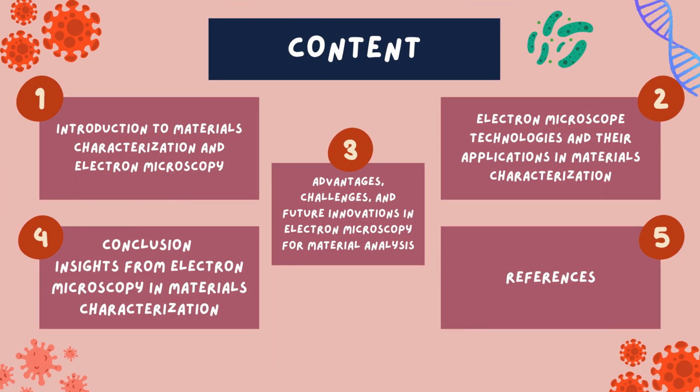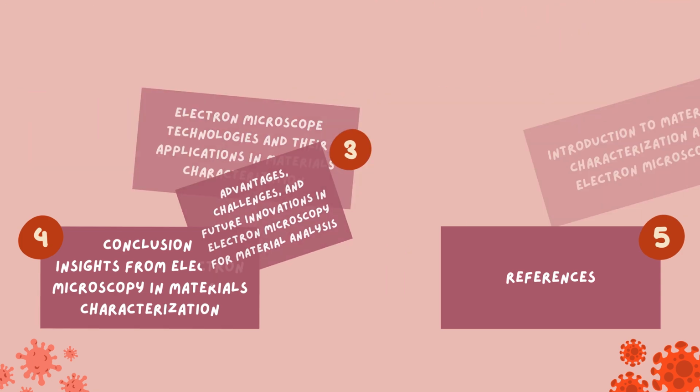So this is all the content for our presentation today. First, introduction to materials characterization and electron microscopy. Second, electron microscope technologies and their application. Then, advantages, challenges, and future innovation. And finally, conclusion, which are the insights from electron microscopy in materials characterization, followed by our references.